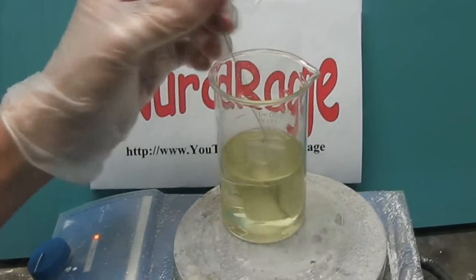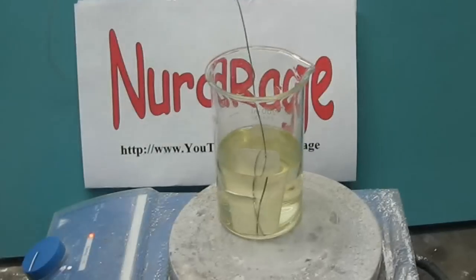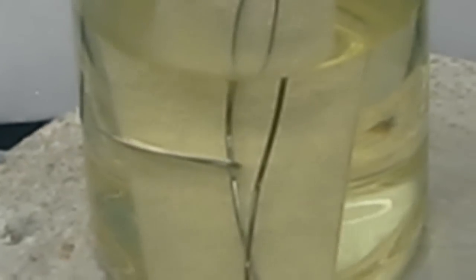So let's change our reaction conditions and use hot nitric acid. Here we have the nitric acid on a heater, and it's slowly warming up. Once we dip in the silver bar, we can see it dissolving into the acid. As it does so, it generates bubbles of nitrogen monoxide gas. As it heats up, the reaction proceeds faster and faster.